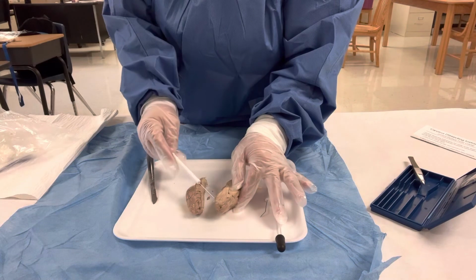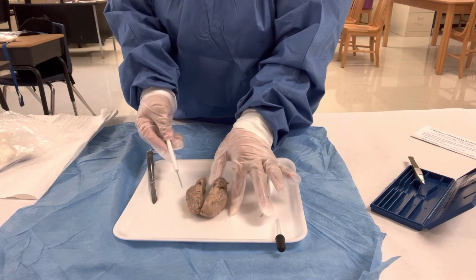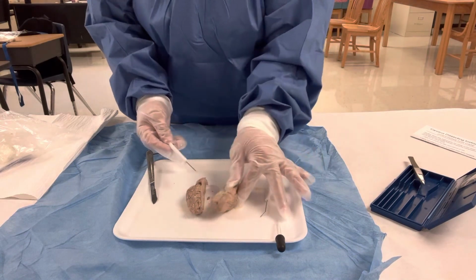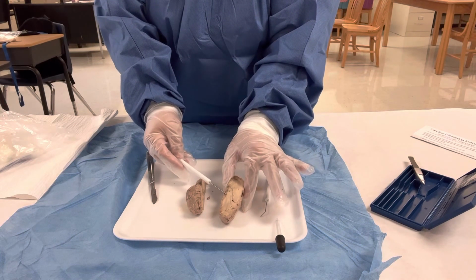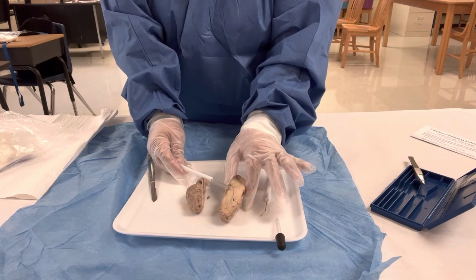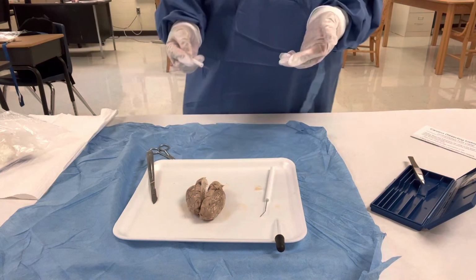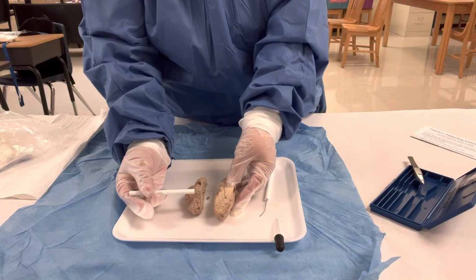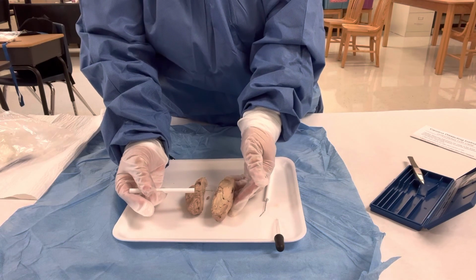The olfactory bulb is up here in the front, and that controls sense of smell. Temporal lobe is hearing and smell. Pons would be like right here. And pons relays messages between the cerebrum and the cerebellum. And let me see, oh. The pineal body would be in here.